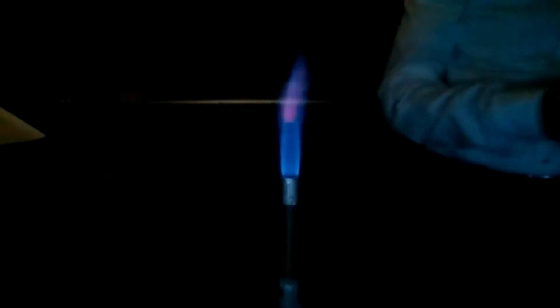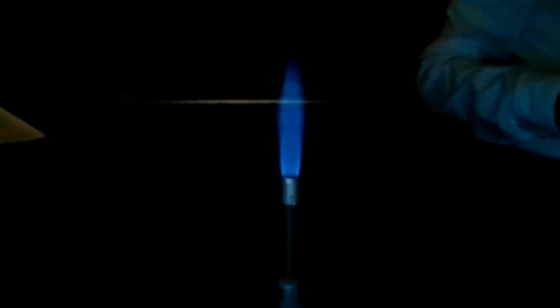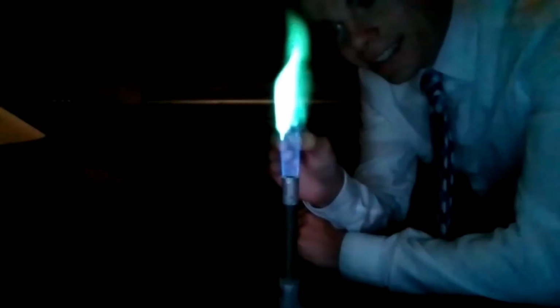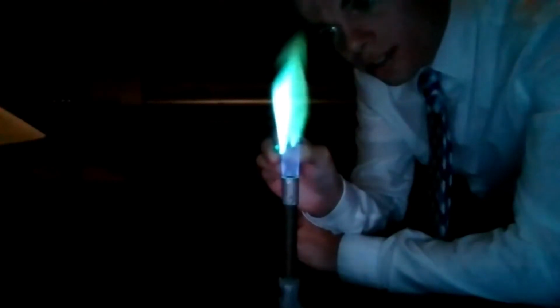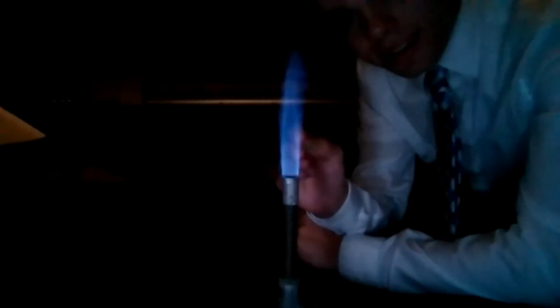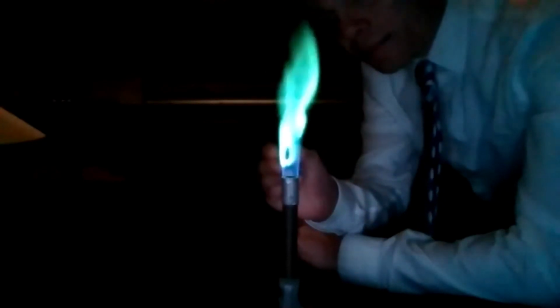Let's see, looks like we have, which one? Copper. Oh, copper is one of my favorites. We might just do copper twice just for the fun of it. Copper's a cool one. Let's see. Look at it. Oh yeah, it's cool. Green. Do any of you guys watch Game of Thrones? No one? It kind of looks like that wildfire stuff, you know, when they burn down the city.